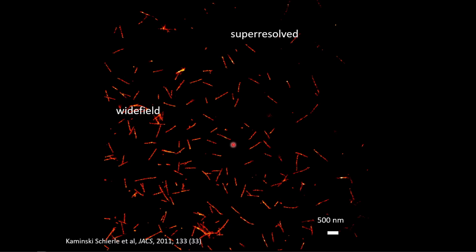Remember Camillo Golgi, and how he found the neurons with the black reaction? It's exactly the same idea, right? Only those neurons turned black where this reaction took place, but the reaction is so terribly inefficient that only a small subset of neurons was visible in each image. So in any one snapshot, you get very high-level information about a small subset of the sample. All super resolution methods work in that way. You trade speed for resolution.